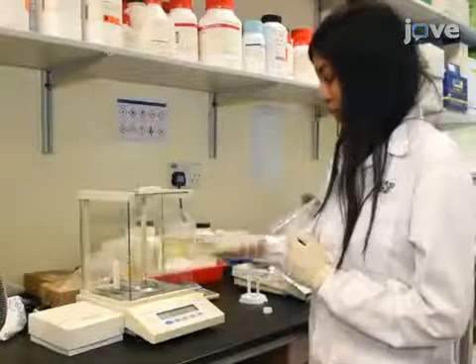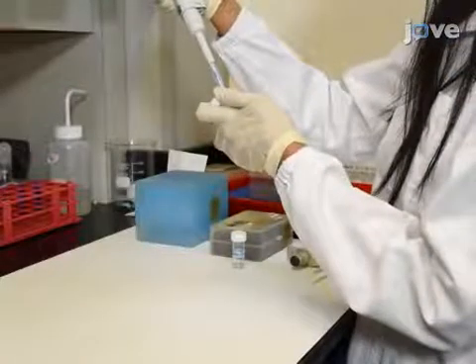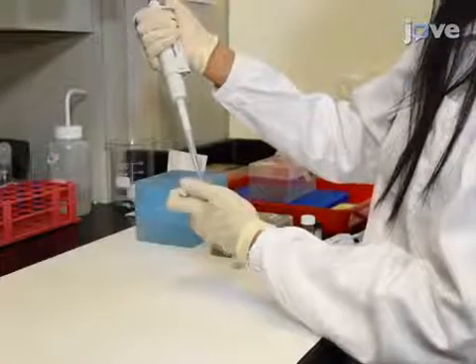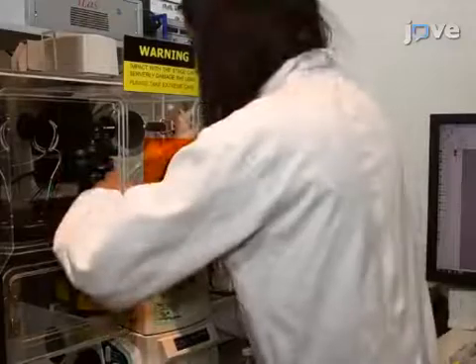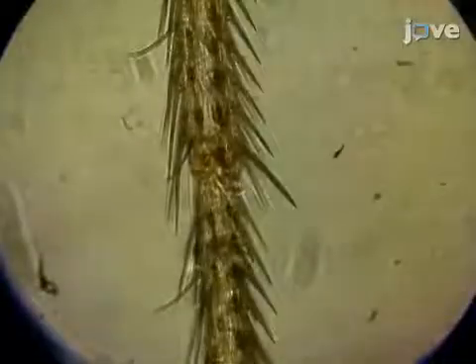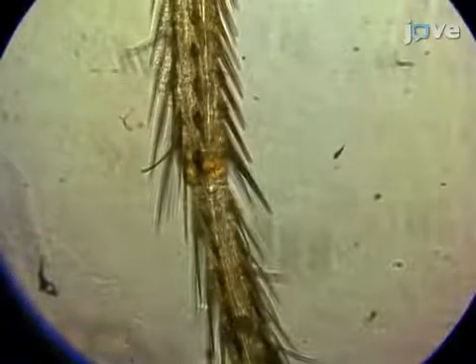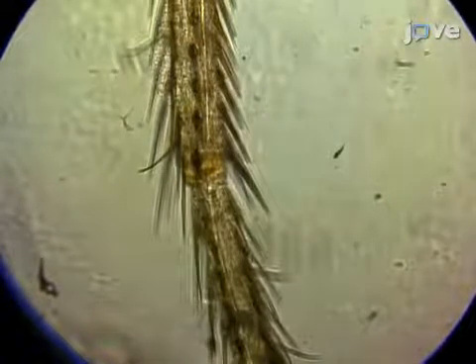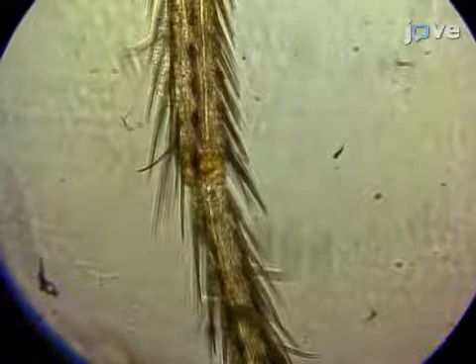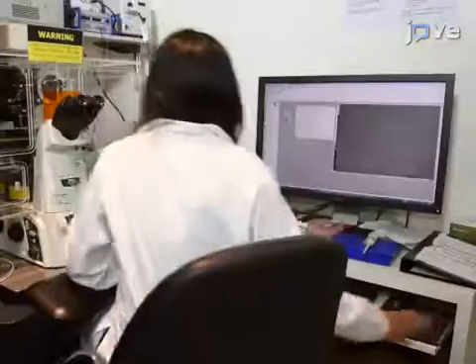For this protocol, prepare the necessary dilutions of the 1 milligram per milliliter stock ligand solution using PBST. To begin the procedure, overlay 10 microliters of PBST onto the secured and exposed tarsal segments. This moistens the leg and prevents it from drifting out of focus. Next, focus on the segments using an optical system which can achieve a good fluorescence signal with rapid time resolution, such as a spinning disc confocal microscope with an sCMOS camera.